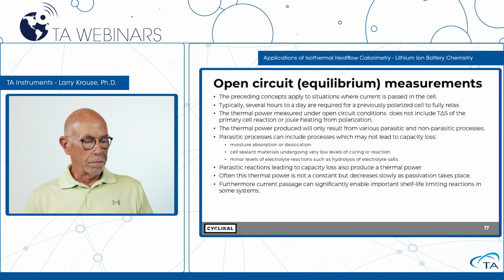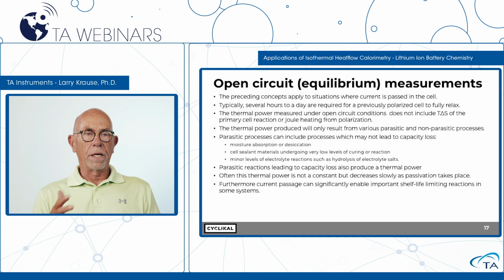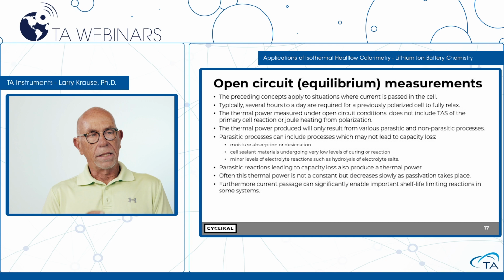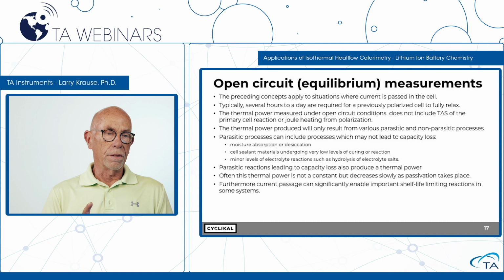Parasitic processes can include a number of things that do not lead to capacity loss. Let's say your container or some part of the external part of the container has a moisture sensitivity. It absorbs moisture. It desorbs moisture. As it's equilibrating with the moisture in the calorimeter, and the battery was different outside, had picked up some water, you bring it in the calorimeter, you're going to see that heat flow from moisture moving in and out of that coating. If there's a sealant on the battery, and that sealant is not completely quiet reaction-wise, if there's a little bit of cure going on in that sealant, you'll measure the reaction of that continuing cure. And we've seen that lots of times. It can be confusing where these heat flows come from.